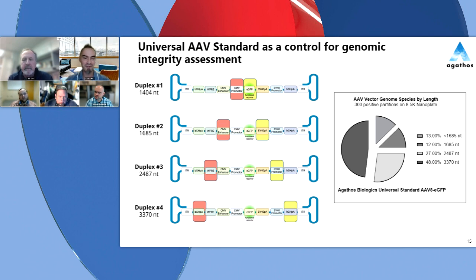And of course, it was very difficult to get some kind of orthogonal methods for us at that time to see if there's any correlation. However, we had then a really nice collaboration with a team from AskBio, and we designed an assay for them, and they did check those values against the NGS data, and actually they got really nice correlations with the integrity.